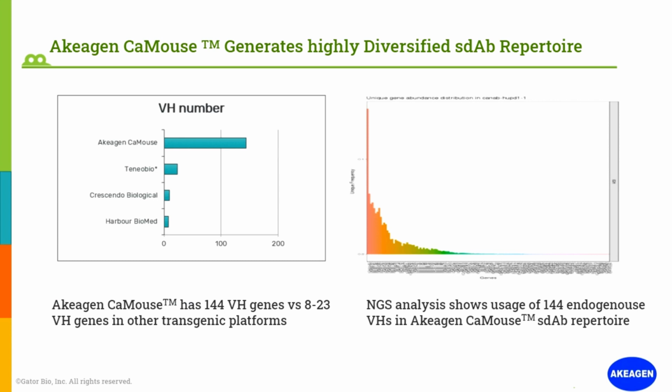However, the usage frequency is different, and this is very similar to the heavy chain usage in conventional, wild-type mice that have both heavy chain and light chain.